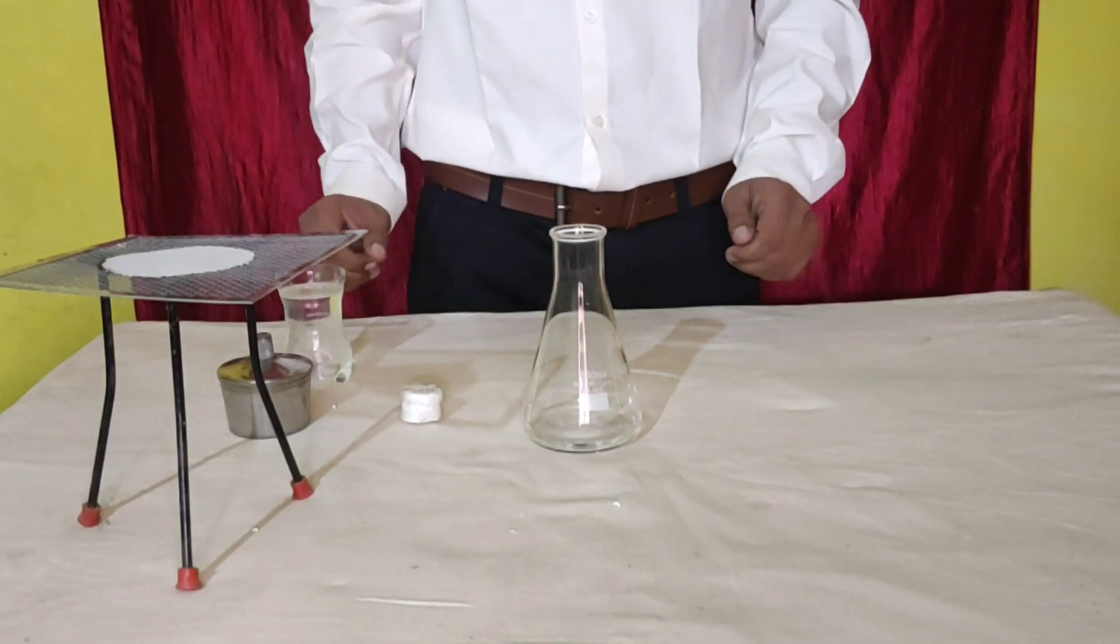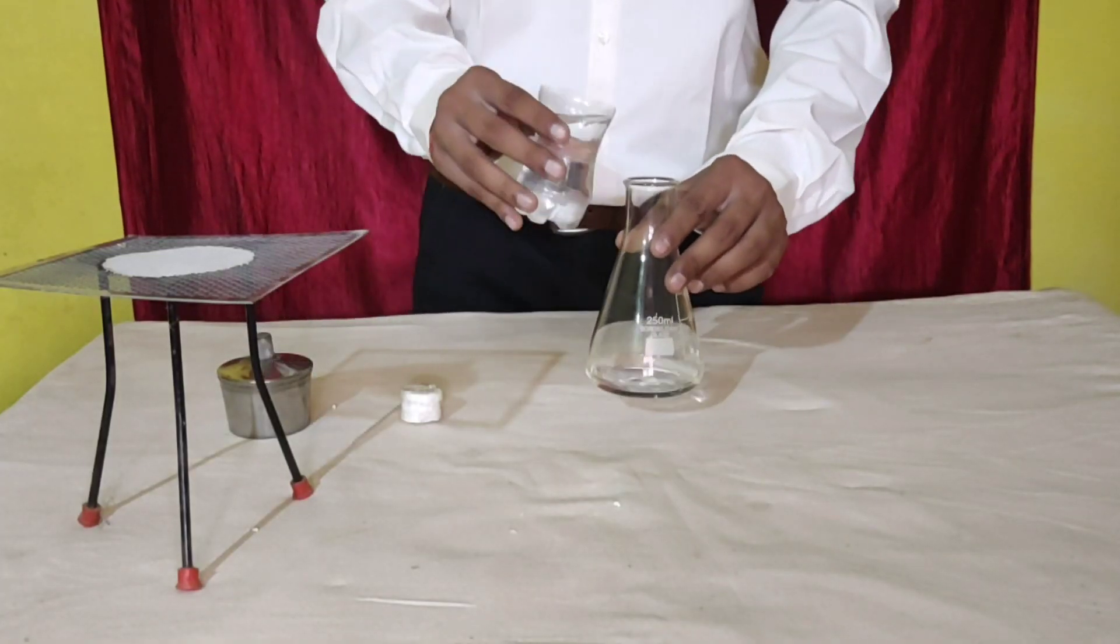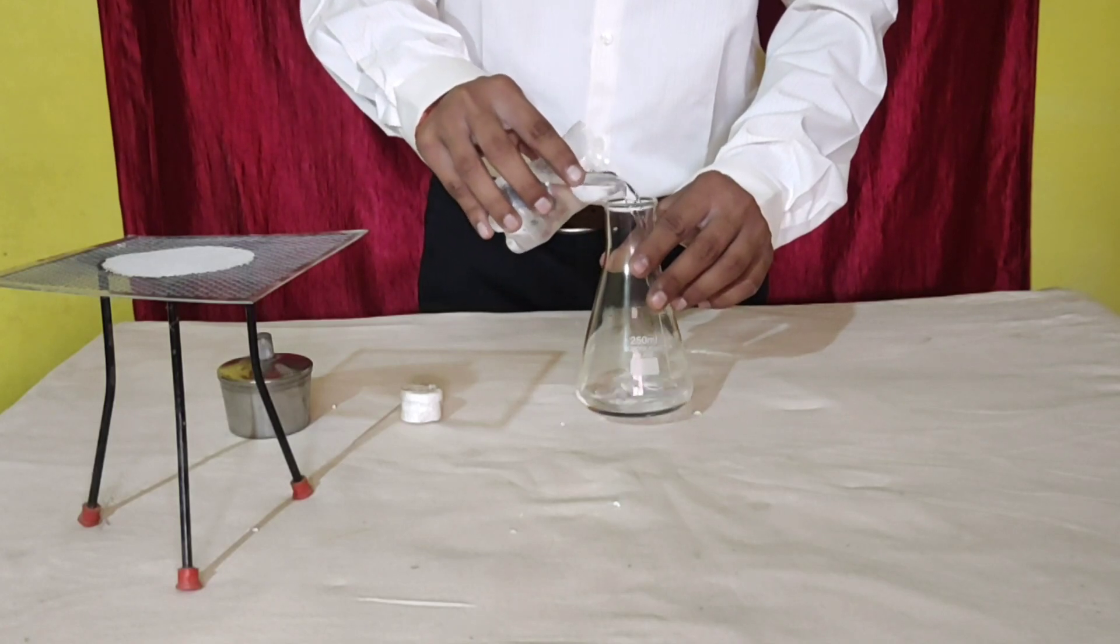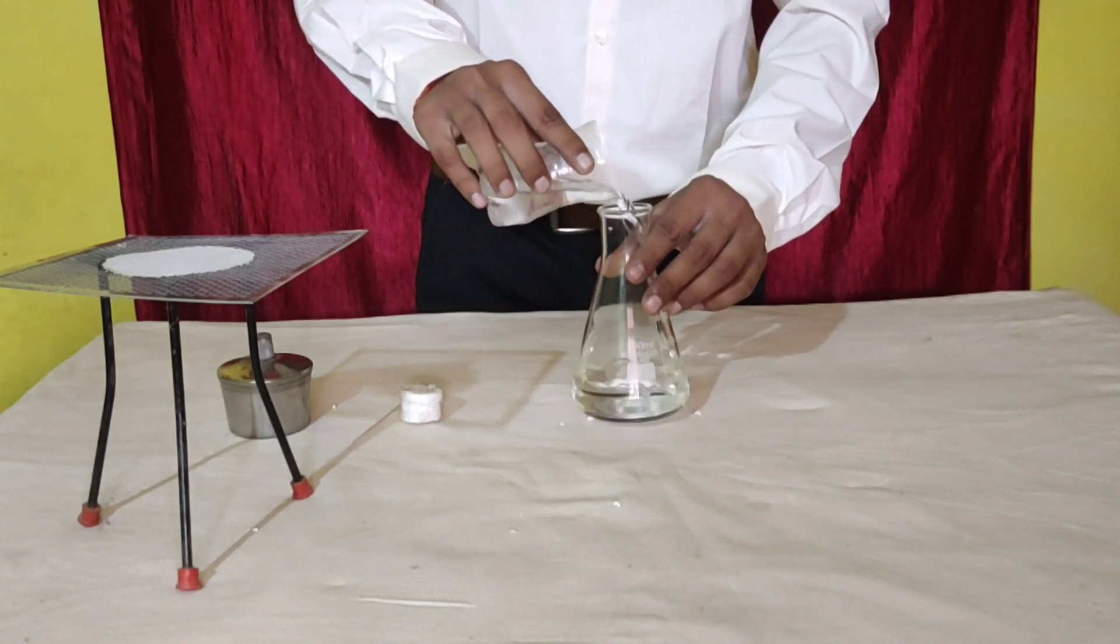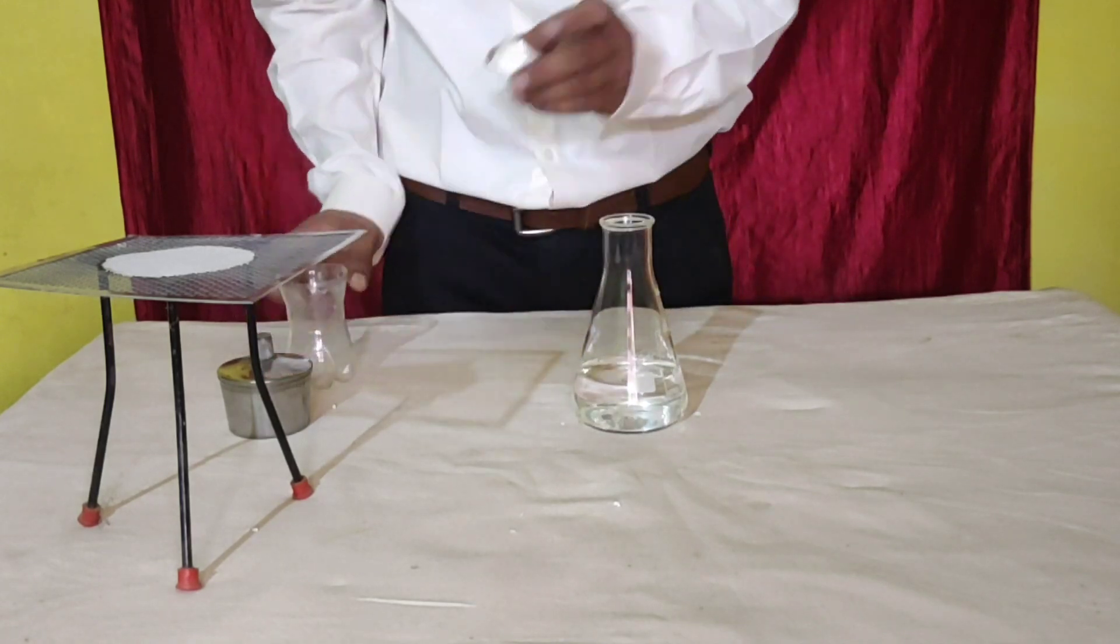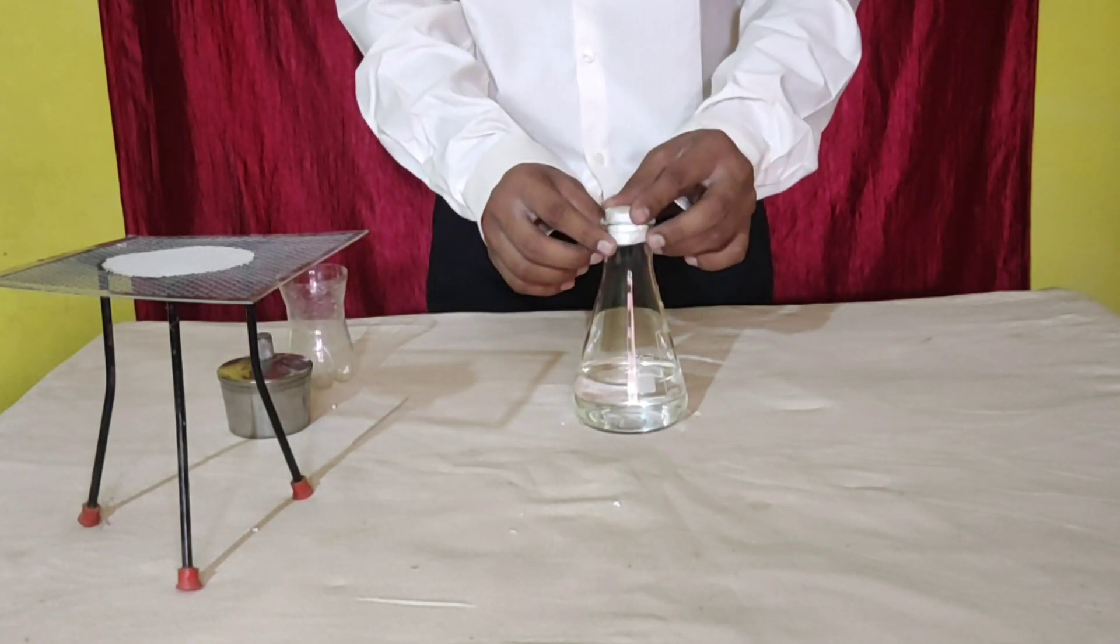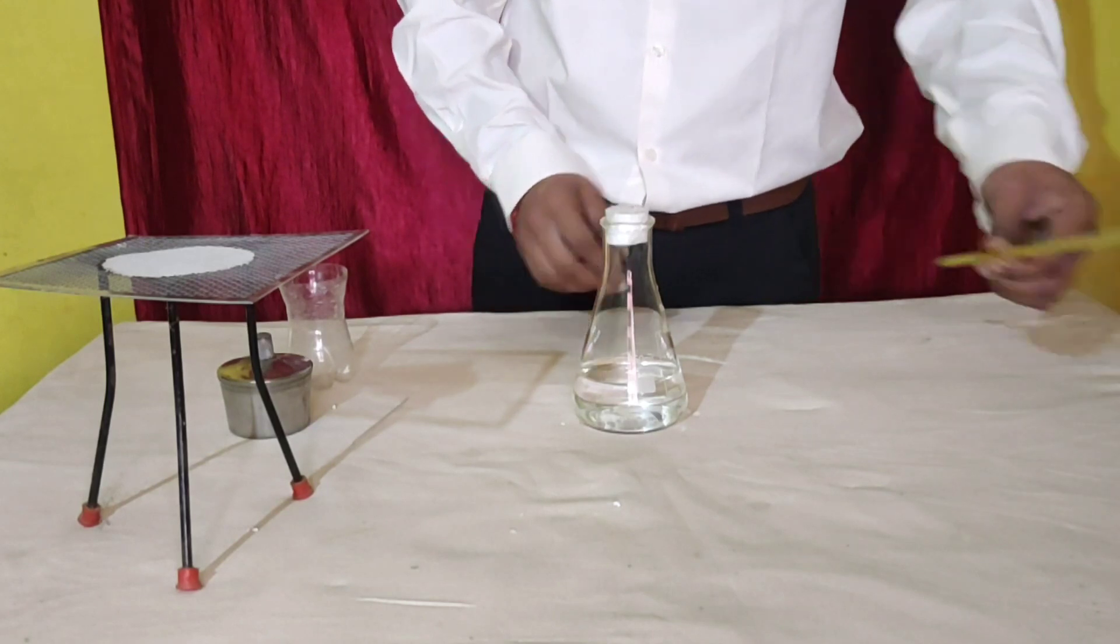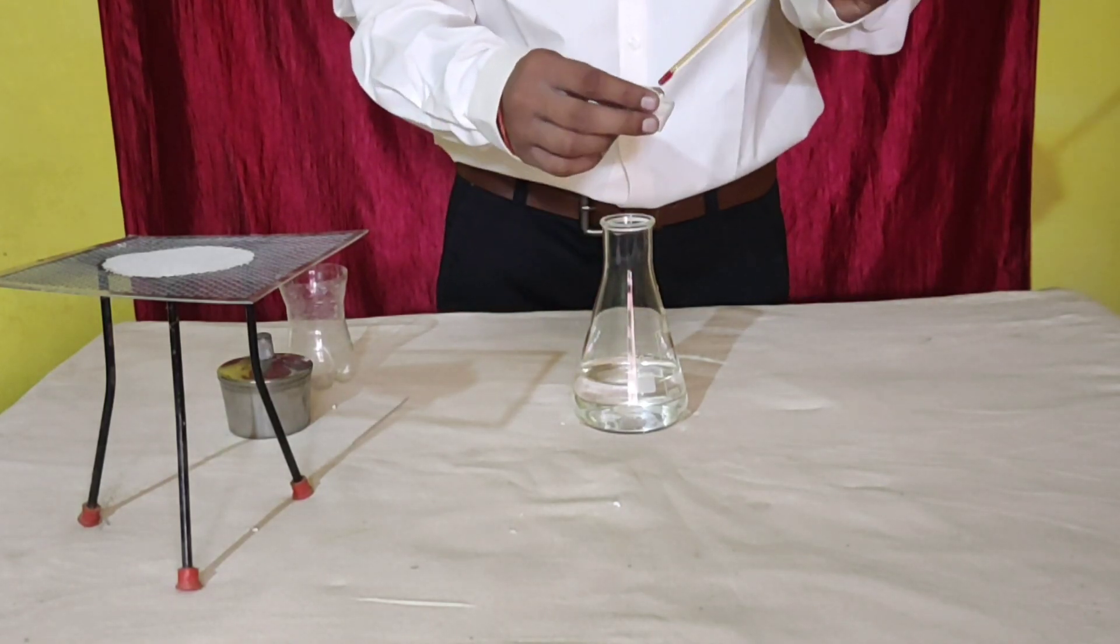About 150 ml of water is taken in the conical flask, and its mouth is closed with a two-holed stopper. Now, fix the thermometer through one of the holes in the cork.